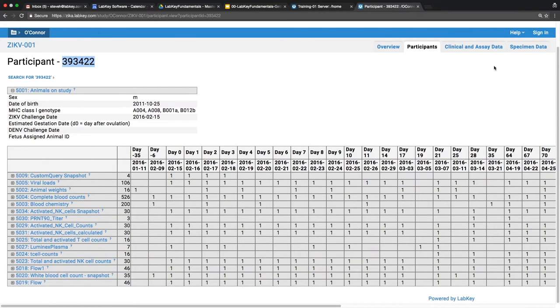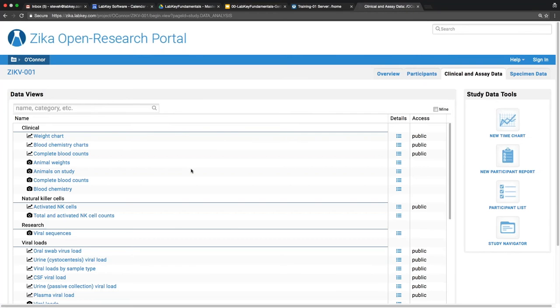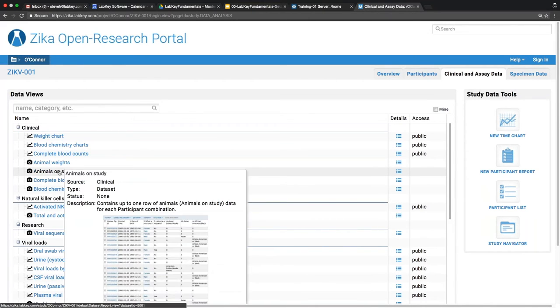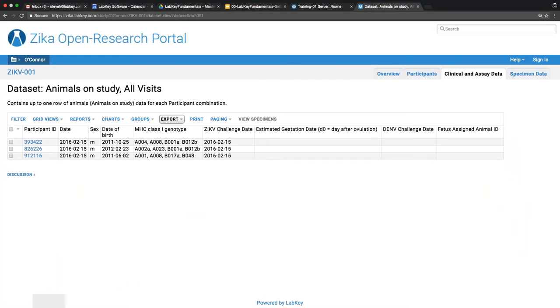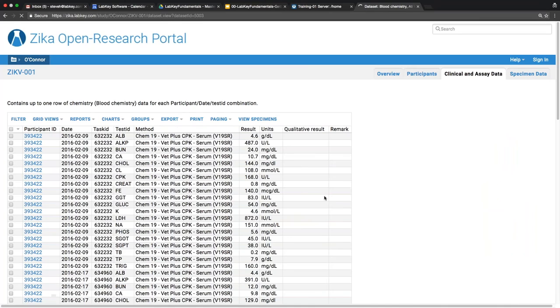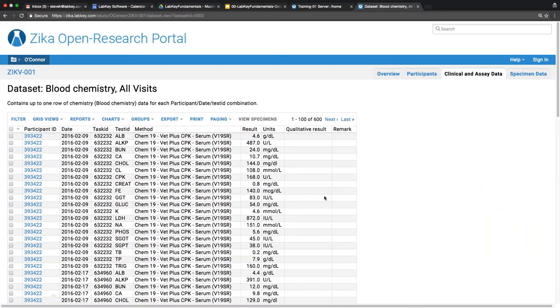There's another way to slice and dice this data — let's look at some visualizations. The most fundamental visualization in LabKey is a data grid. This data grid was either a single Excel file or multiple Excel files imported into LabKey. Just to remind you, I'm not a logged-in user here — I have not signed in. I am just a casual user who knows this URL, zika.labkey.org, and I'm able to surf all around it and look at this data because David O'Connor specifically opened it up.